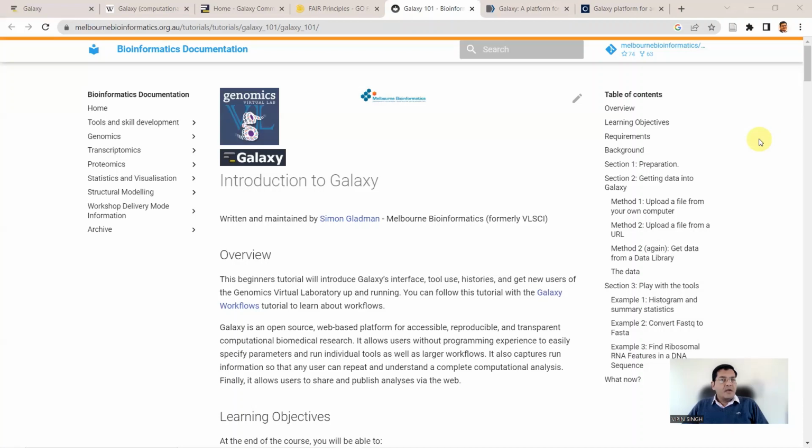And over the last few lectures, I have been emphasizing the importance of programming in biotechnology. Like all other fields, biotechnology too is under transition, and it is fast becoming a data-driven science. This is largely because of the omics revolution. We are now mostly dealing with high throughput techniques, and therefore the data that comes out is large in volume and also large in variety. It is not manually possible to analyze such data, and that necessitates a certain level of programming expertise in the candidate to analyze the data.